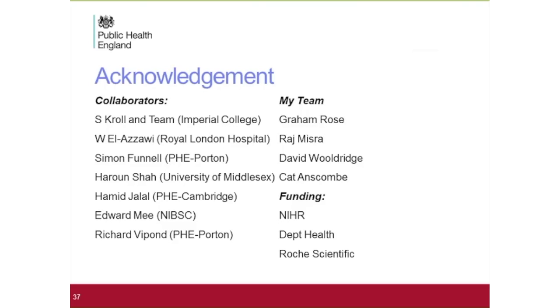And anything below, we really had to discard, in the cases of 16S sequencing, at least 35% of the read, while for shotgun, we were discarding about 62% to 65% of the reads in order to ensure that fragmentation doesn't affect a bias in assembly and therefore inappropriate allocation to taxonomical group.